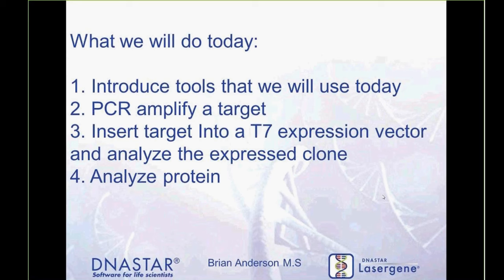Primarily the DNASTAR Navigator, SeqBuilder, and our Protein 3D application. We will bring in a sequence from Entrez, and then we will PCR amplify a target. We will insert that target into a T7 expression vector. And in analyzing that expressed clone, we will translate that clone and also analyze the protein.